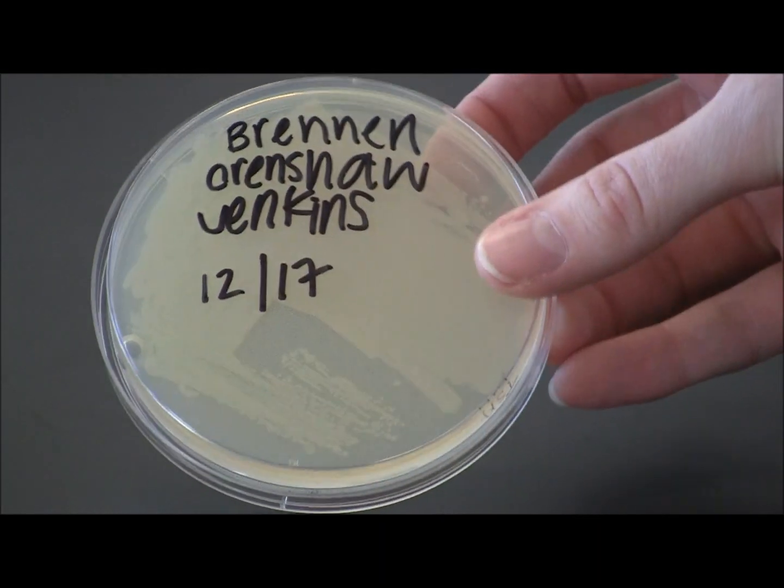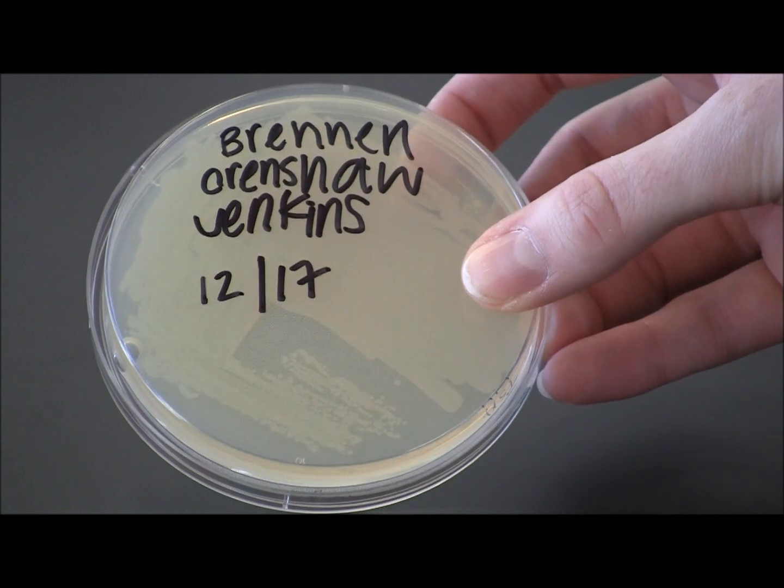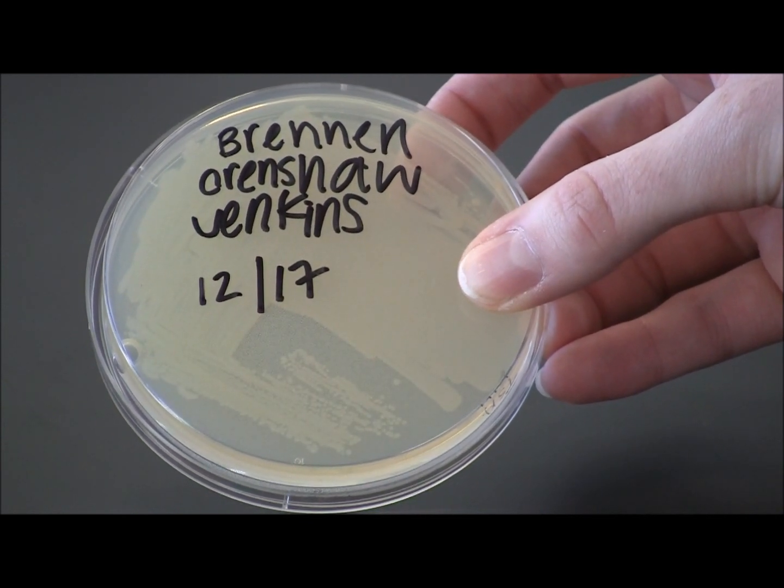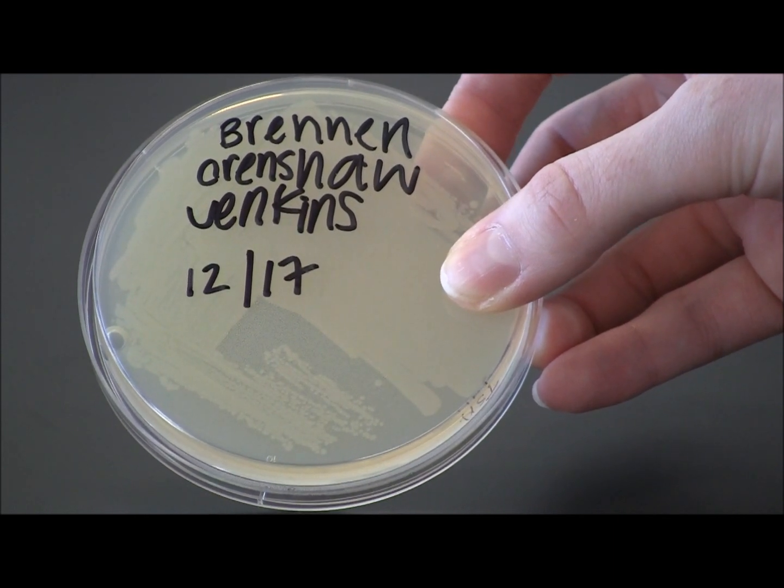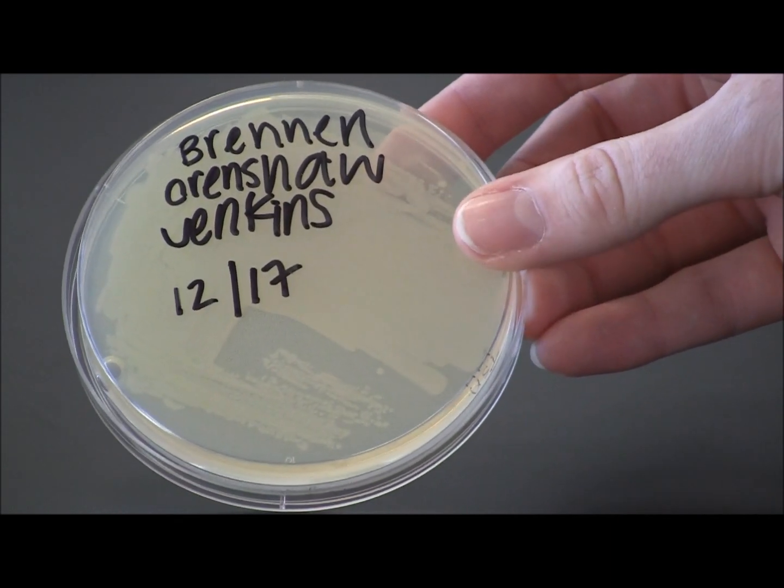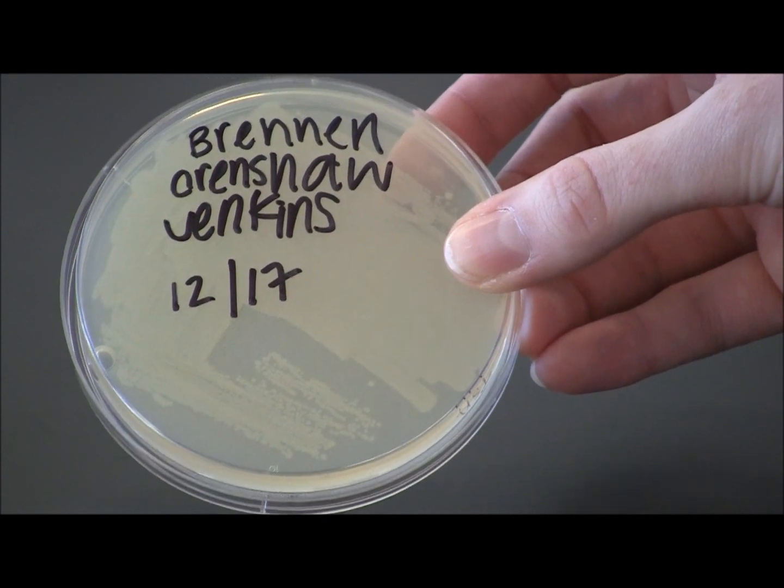This is an example of an improperly labeled plate. You can see that the name is not written in initials, it's written out full. The date is on there, but the year is not included, and there is no indication of what kind of bacteria is growing on this plate.